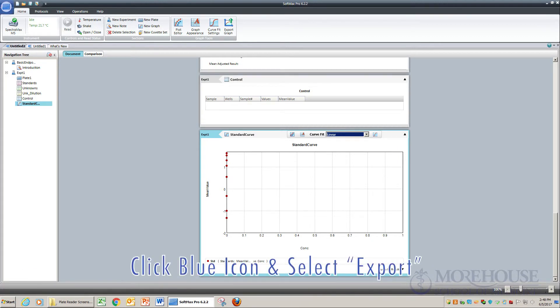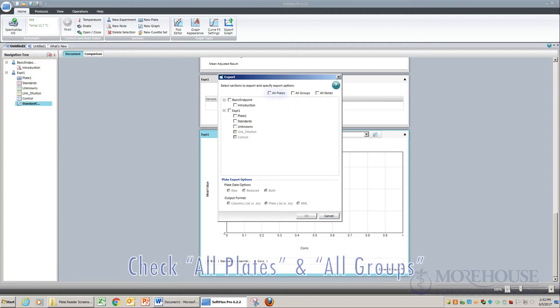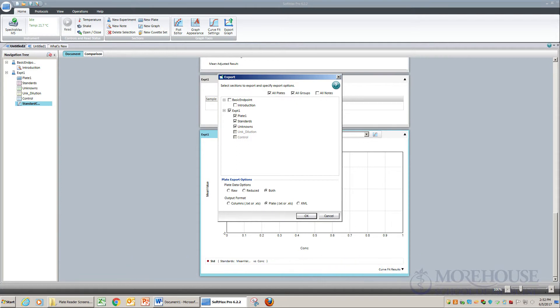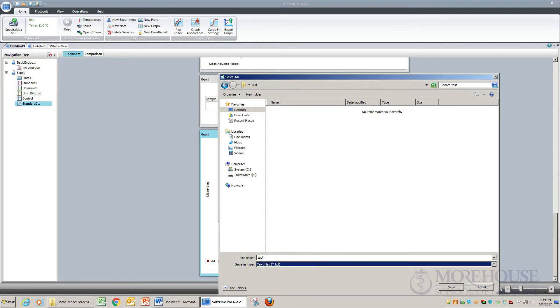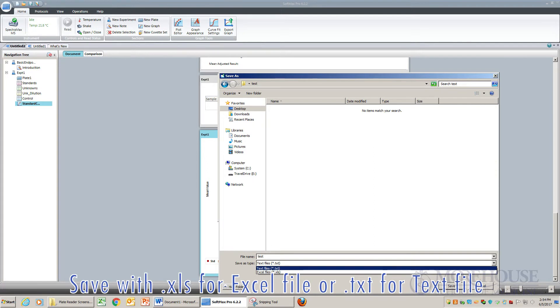Click the blue icon and select Export. Check all plates and all groups, then click OK. Save with .xls for an Excel file or .txt for a text file.